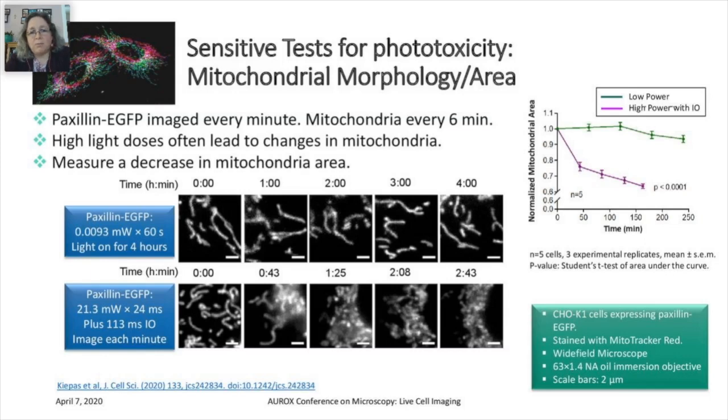And in the top panel, we were able to image for a full 4 hours with the light on constantly, whereas in the bottom panel, we image only for not even 3 hours before the cells are really compromised.